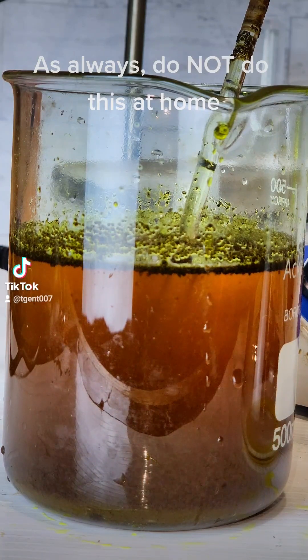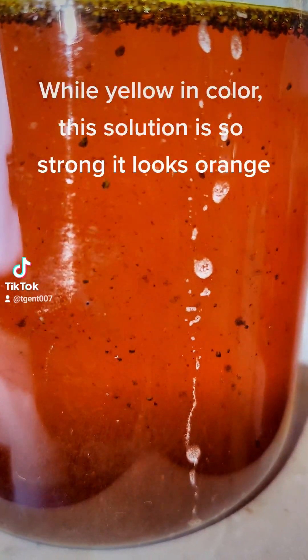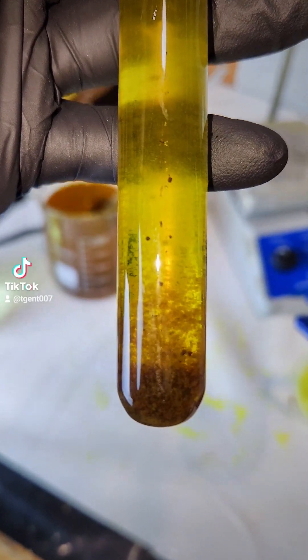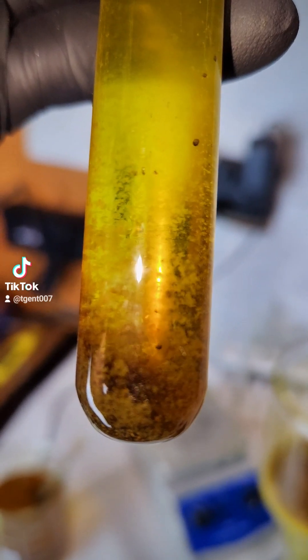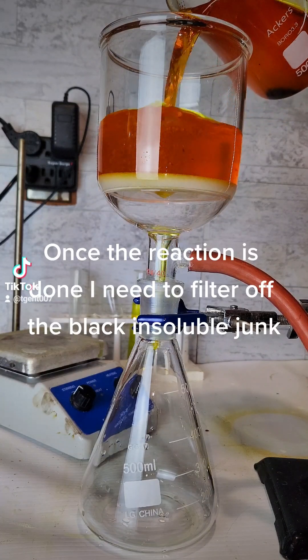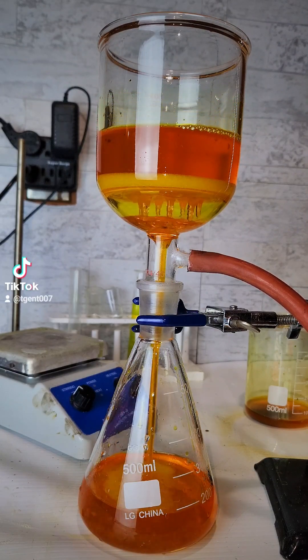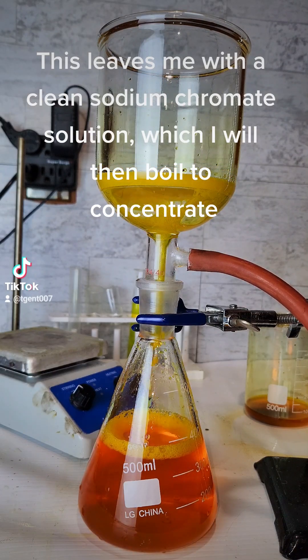As always, do not do this at home. Eventually, I am left with a dirty solution of sodium chromate. While yellow in color, this solution is so strong it looks orange. Once the reaction is done, I need to filter off the black insoluble junk. This leaves me with a clean sodium chromate solution, which I will then boil to concentrate. This is done outside due to the high toxicity of chromates.